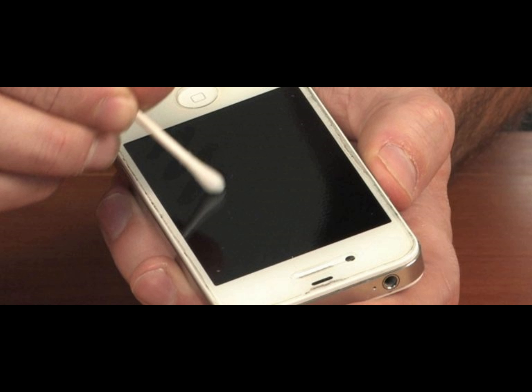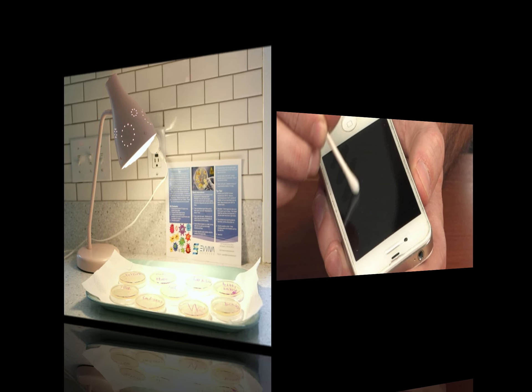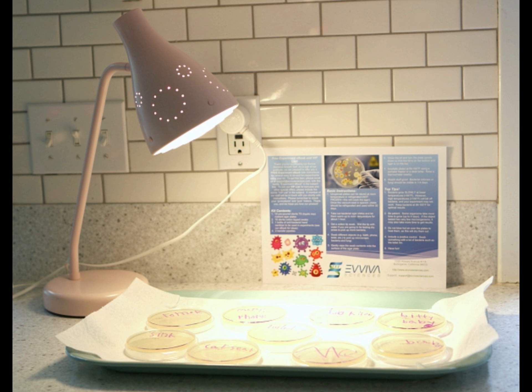Once students have separated into their lab groups and have all materials, they may begin swabbing for bacteria throughout the classroom. Once students have sealed and labeled their petri dishes, they will need to place them in a warm area so as to allow the bacteria to grow.